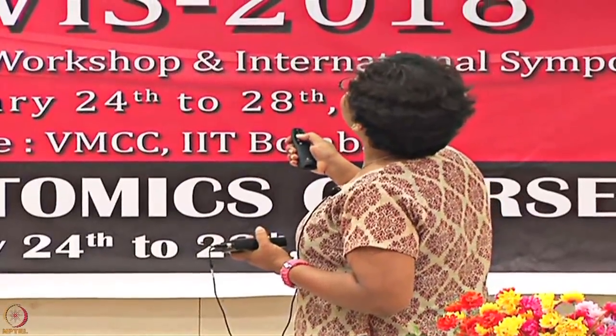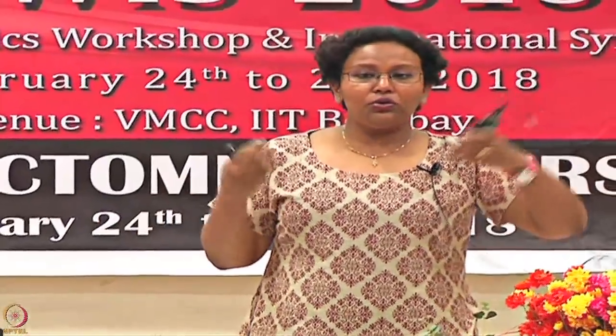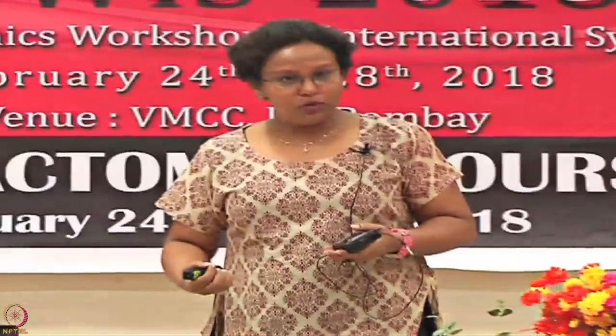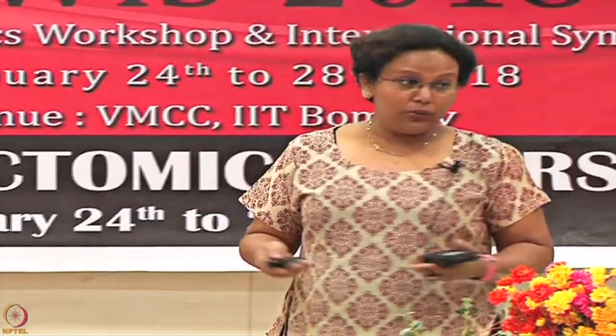So in this case you can see that pH 5.5 is the lowest and the highest is pH 4. So what do you think it means? Does that mean that pH 4 is the best for immobilization? Most people think that the lower the pH we go, the more we can attract the protein and eventually we can get the best. And well, there is some amount of truth in that, but not always.